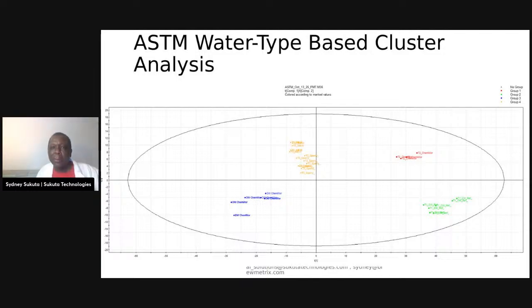This is where the RO water is. Actually, I have two companies' water here. The one here is one company, and the ones down here are another company. So even within the RO, which I know brewers like to use, there's a bit of discrepancy here and there, but more or less they match. These companies were pretty much a match.